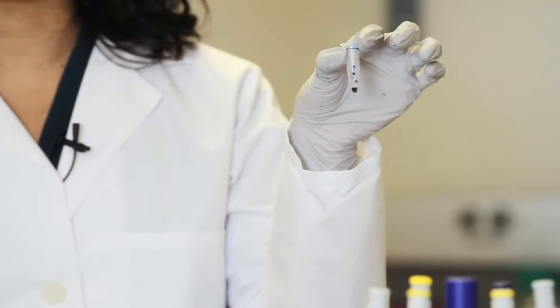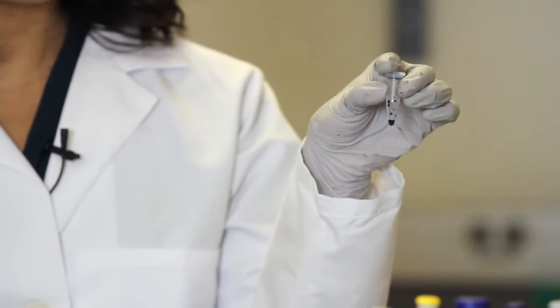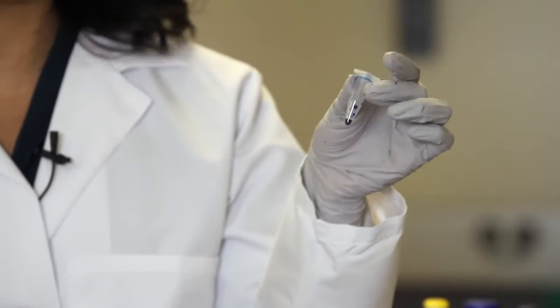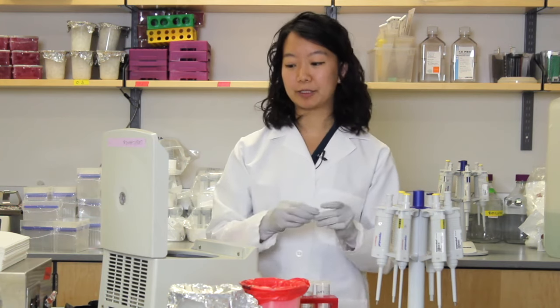The first application of centrifugation in biology that I'm going to show you is the collection of samples at the bottom of your tube. You can see here I have my sample of blue liquid. If I shake up my tube, my sample will be dispersed throughout the tube. When I'm working with such a small volume, these tiny droplets will actually take up a more significant ratio of my total amount of sample and can actually make a big difference in my experiment. And so I'm going to want to collect all my sample at the bottom of the tube.